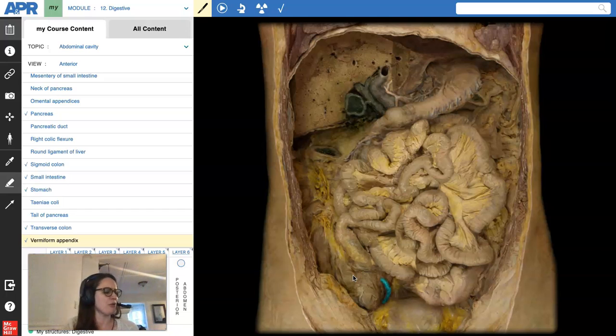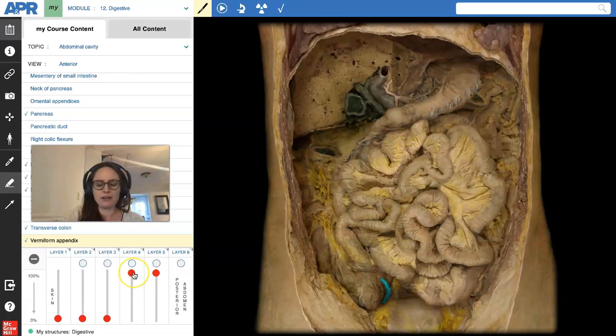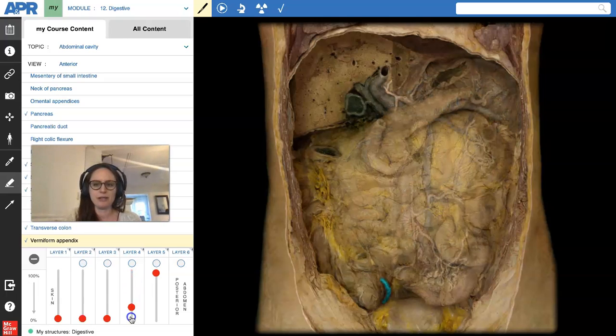All right, I'm going way too slow right now because I'm just talking about stuff, but that's what a virtual dissection is for. That's what the dissection is for, really, is to make some connections between these things. So I'm trying to go superficial to deep rather than do something alphabetically. I don't think it makes sense to do things alphabetically.